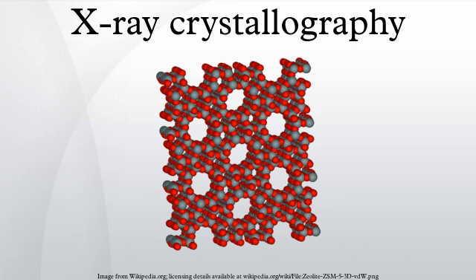Other X-ray techniques. Other forms of elastic X-ray scattering include powder diffraction, SAXS, and several types of X-ray fiber diffraction, which was used by Rosalind Franklin in determining the double helix structure of DNA. In general, single crystal X-ray diffraction offers more structural information than these other techniques. However, it requires a sufficiently large and regular crystal, which is not always available.